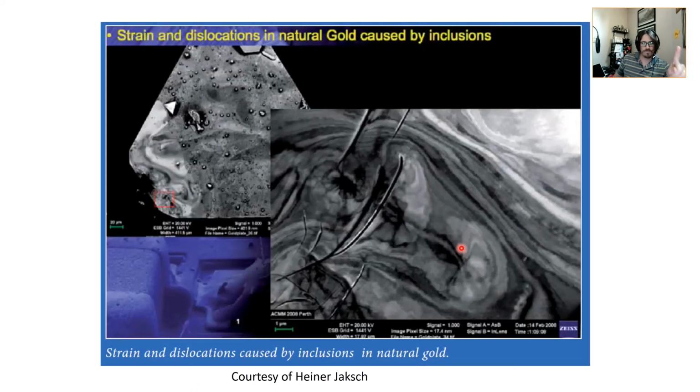One thing that gets me is that the assertion by Zeiss was that these are dislocations, and there's no way that these are dislocations. They're too big to be dislocations. Two, you cannot see dislocations unless you're using a TEM. I'll just go out there and say it. So this is a little bit wrong. Always be careful when vendors try to tell you something.